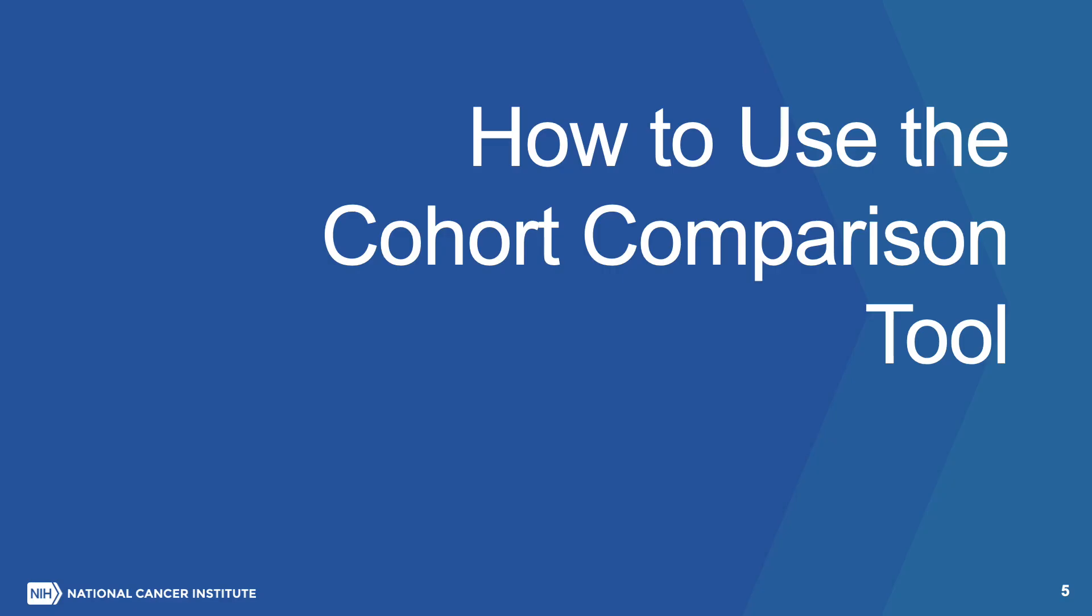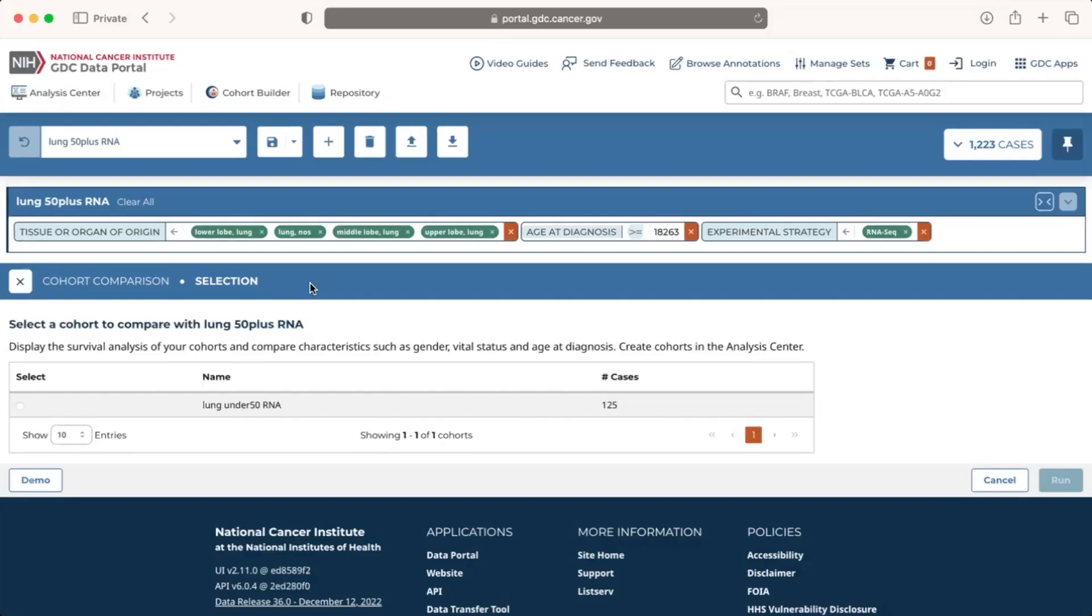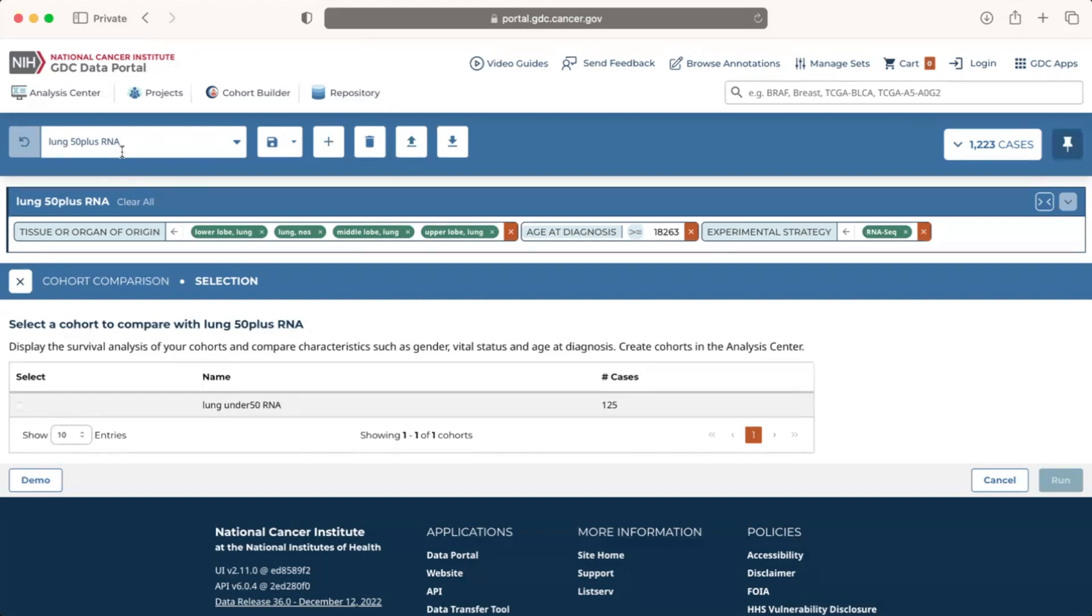How to use the Cohort Comparison Tool. When the Cohort Comparison Tool is launched, we will see the active cohort in the cohort toolbar. Note that before we can run the Cohort Comparison Tool, we must have two cohorts already created. If you do not have two cohorts, please pause this video and use the Cohort Builder Tool to create them. You can refer to the GDC Cohort Builder video for assistance.